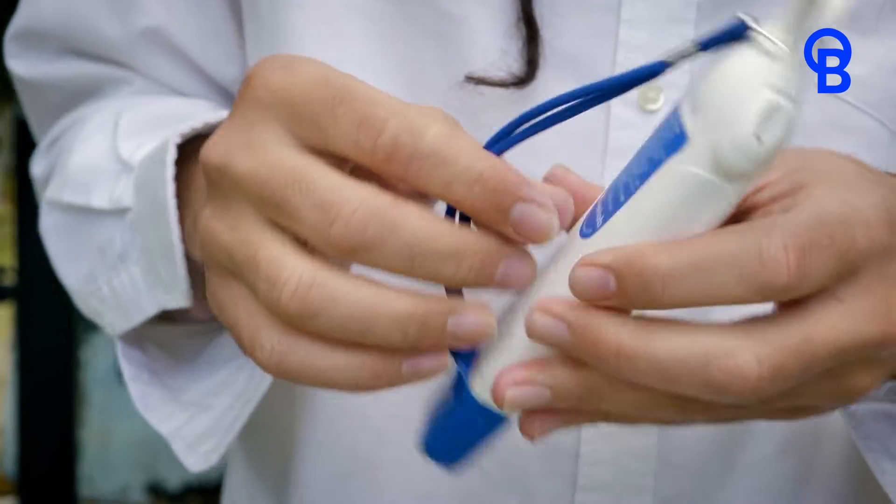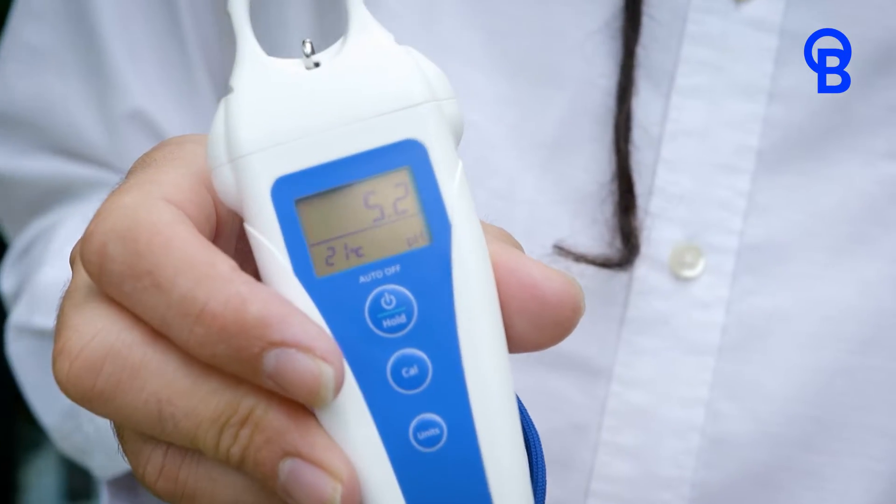It's really important to keep pens hydrated, so the storage cap helps keep the pen wet. We've also got this lanyard so you don't lose that cap. Our Bluelab Pen has a backlit screen — nice and easy to read during the night or in daytime.